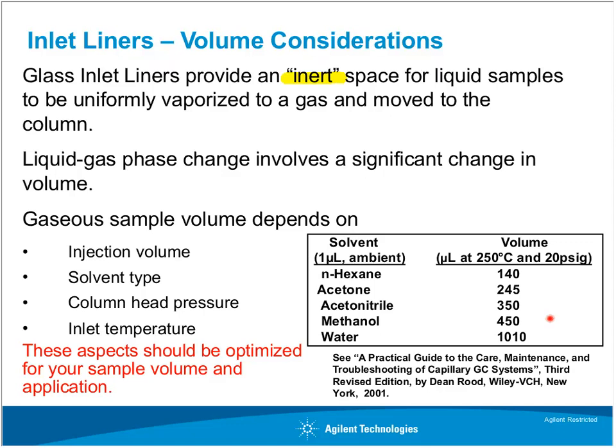And you can see that, hopefully, this is raising some flags with you, because this might be problematic. There is going to be a certain volume that our inlet, and especially our inlet liner, can accommodate. And we're going to key on water in particular as we go through the next few slides.